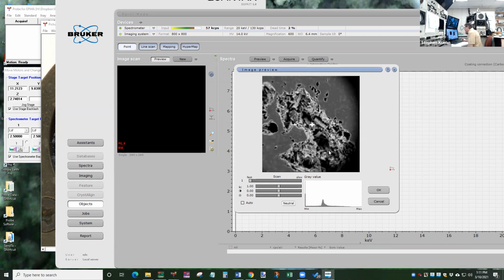All right. Well, maybe the thing I clicked on isn't actually a crystal. Actually, it looks like a hole. Okay, so that might be worth noting too, because one of the things we often look for in volcanic rocks is whether they have bubbles or had bubbles, which, since it's solidified as a rock, are now holes.